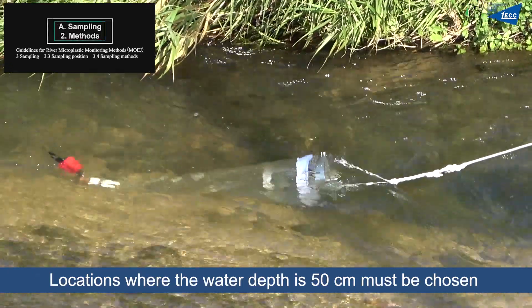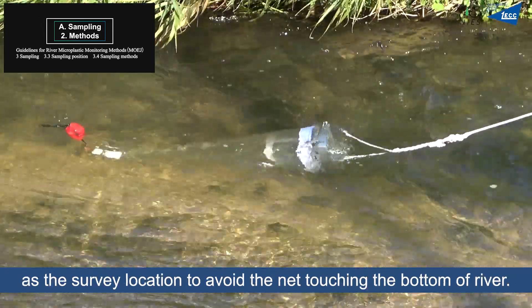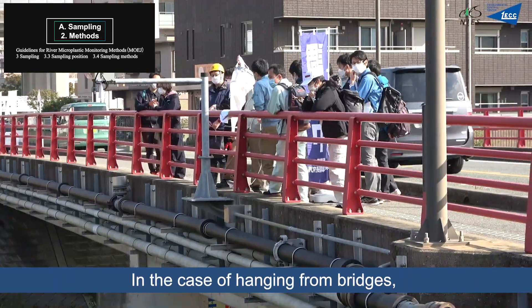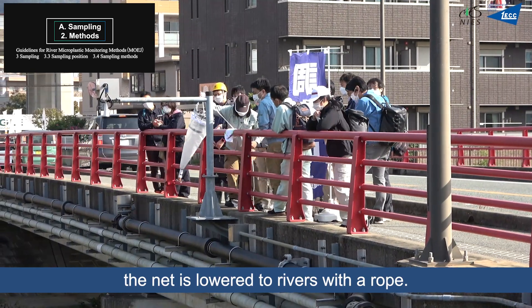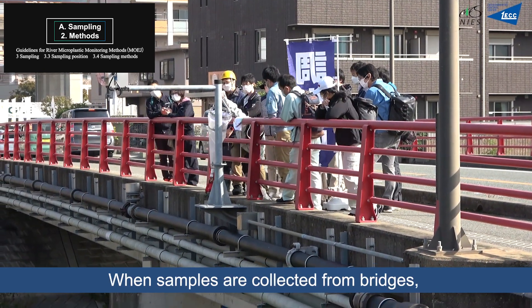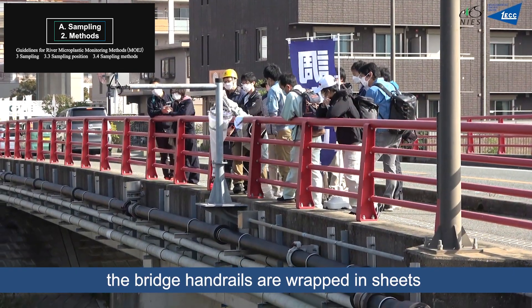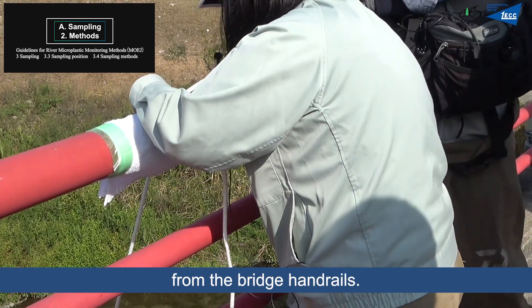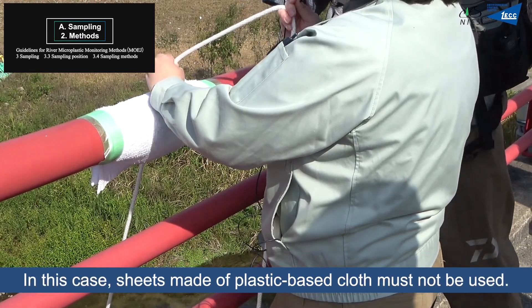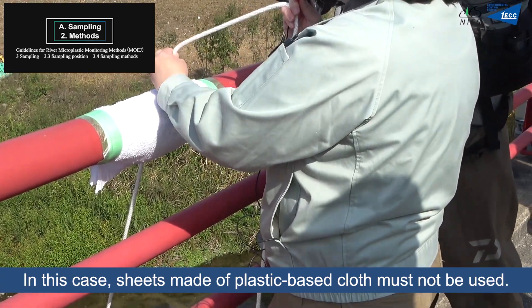Locations where the water depth is at least 50cm must be chosen as a survey location to avoid the net touching the bottom of the river. In the case of sampling from bridges, the net is lowered into the river with a rope. The bridge handrails are wrapped in sheets to prevent contamination of the net by coating debris falling from the handrails. Sheets made of plastic-based cloth must not be used.